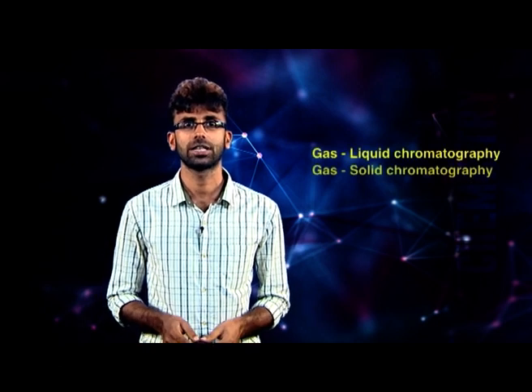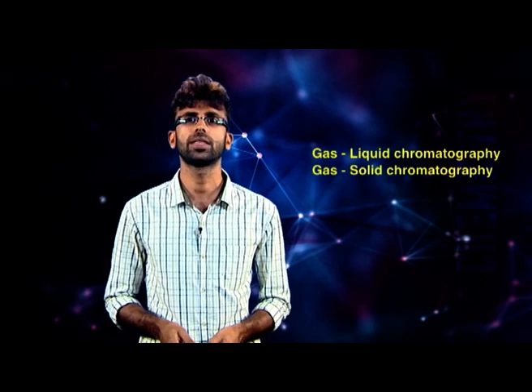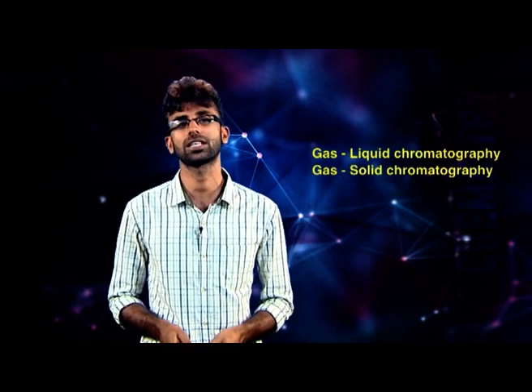Good morning. In this section, I will be discussing the two most commonly used chromatographic methods in research and analytical laboratories. The first one is gas chromatography. As we discussed during the classification based on the mobile phase and stationary phase, there are two types of gas chromatography. One is gas liquid chromatography, and the other one is gas solid chromatography. The more important one at the application level is gas liquid chromatography. Therefore, GLC is simply referred to as gas chromatography.